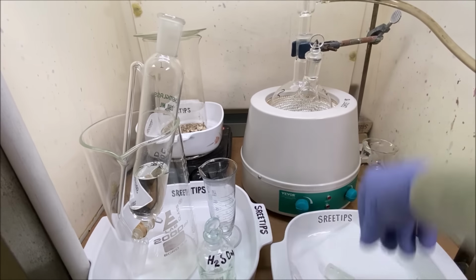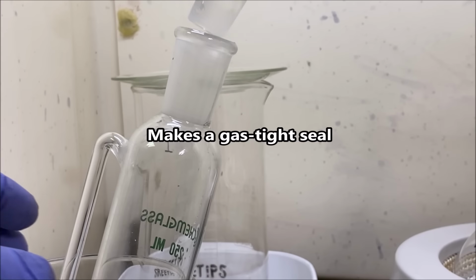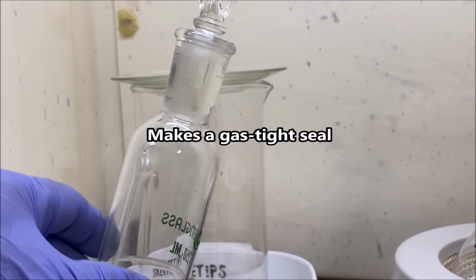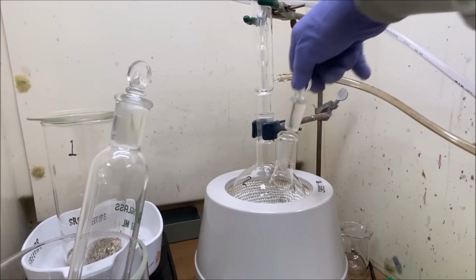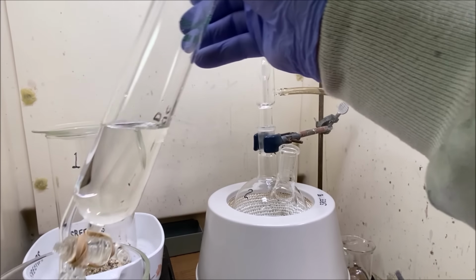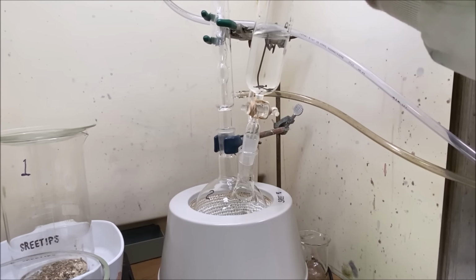Perfect. And up here, seals it up, makes a gas tight seal for us. Now we're gonna install our nitric acid addition funnel to this connection on our flask.